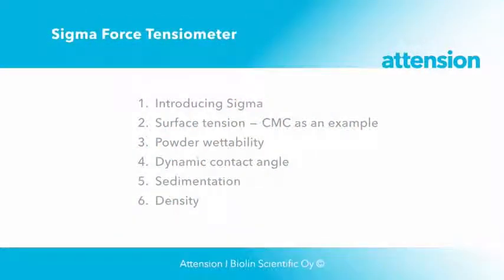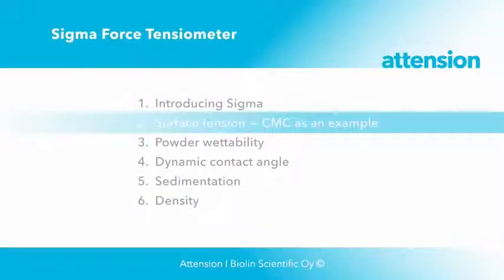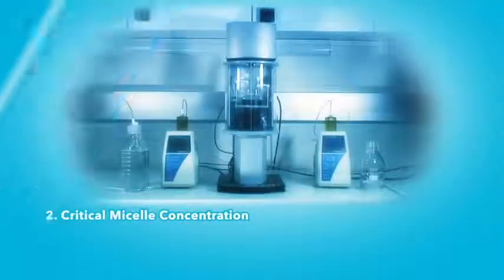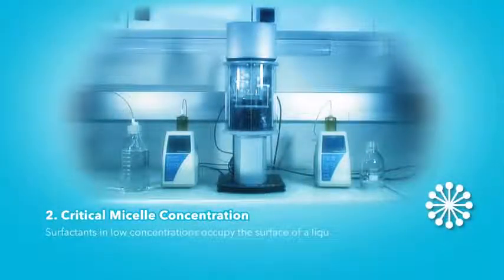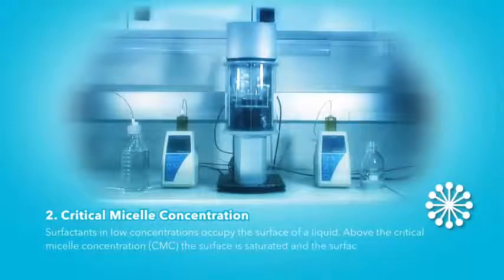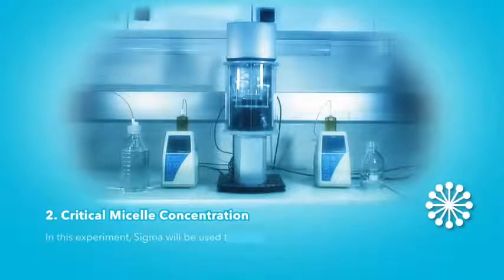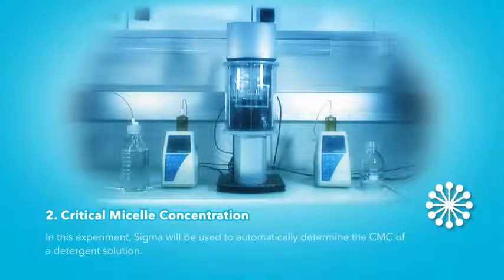Next, a surface tension is measured to determine critical micelle concentration. Surfactants in low concentrations occupy the surface of a liquid. Above the critical micelle concentration, the surface is saturated and the surfactants form micelles. In this experiment, sigma will be used to automatically determine the CMC of a detergent solution.